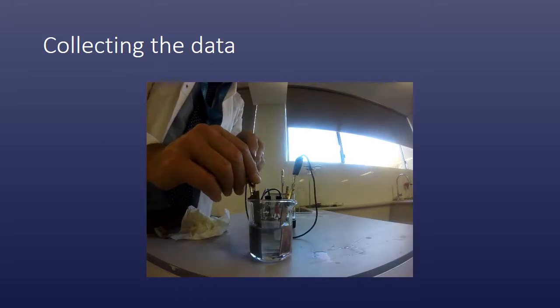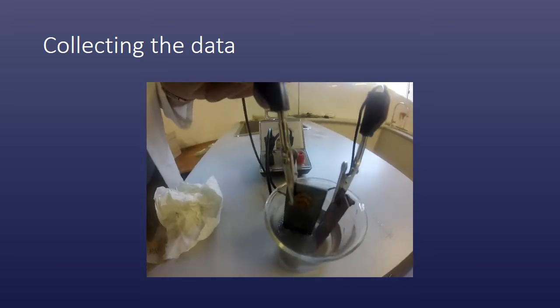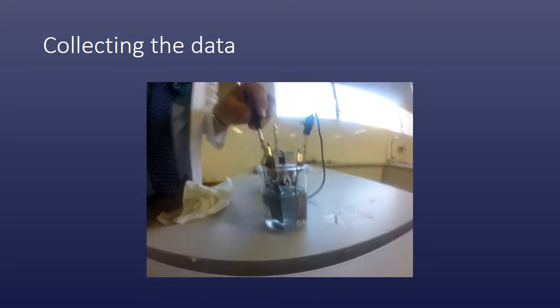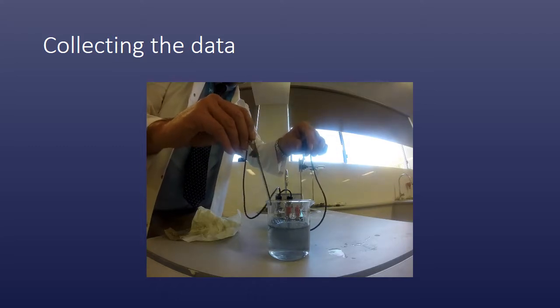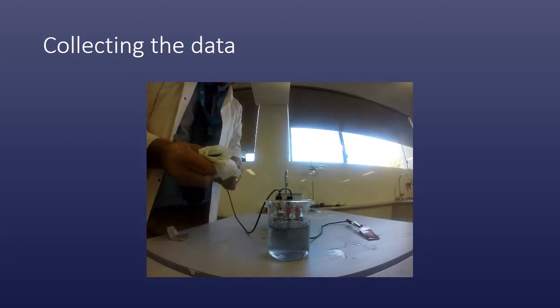Okay, well the reading is higher, but there's a couple of things to notice. Now I've got a reading of 1 volt, but I've also got a lot of things happening. Actually, you can see on one of these electrodes there's a huge number of bubbles that are occurring. So in actual fact, I've got a different reaction happening here. You can see how quickly that water, the solution, has decolorized.